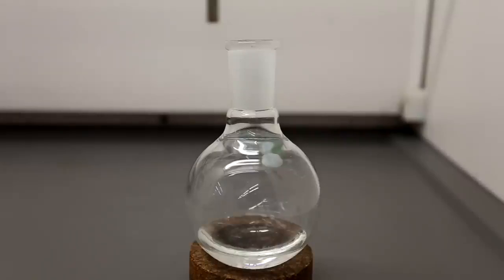The final yield of glacial acetic acid was about 35 milliliters. The product was quite pure with a density of about 1.052 grams a milliliter.